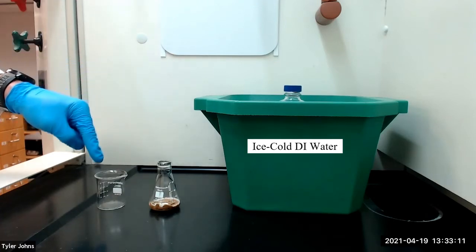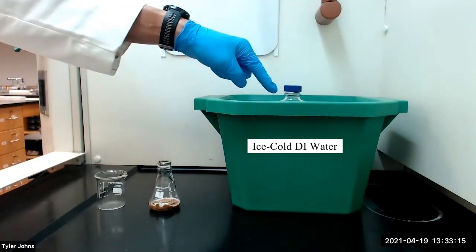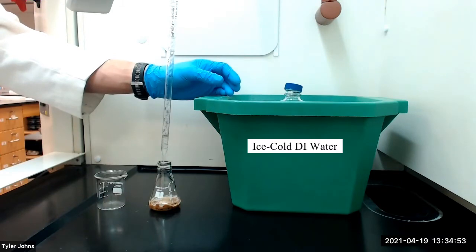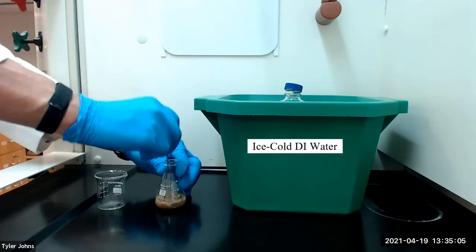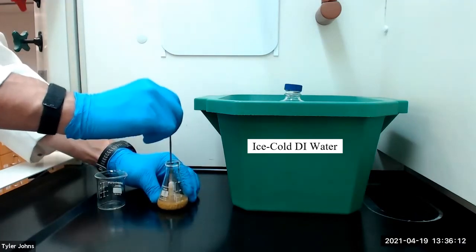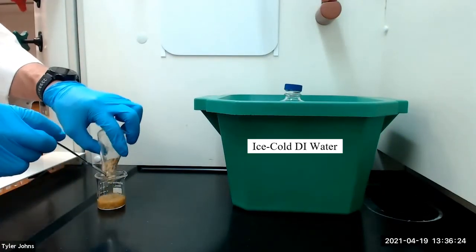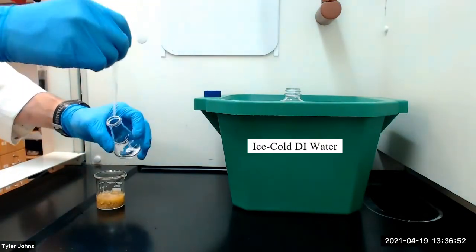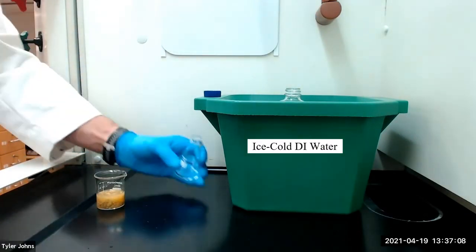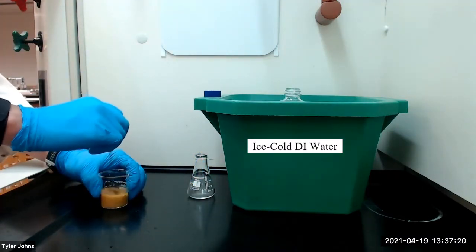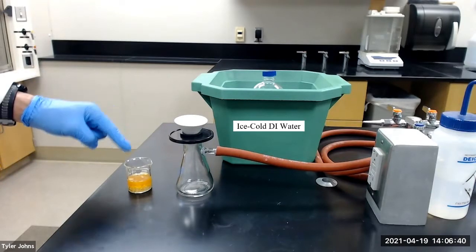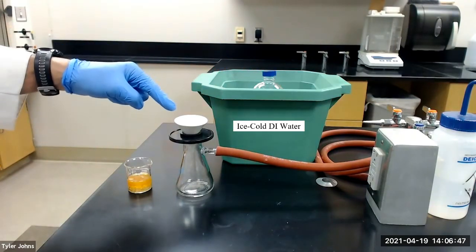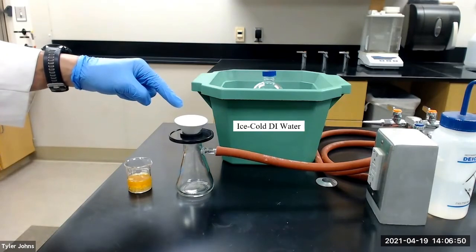We will then transfer the mixture to a small beaker using an additional 5 milliliters of ice-cold water. We will then stir the precipitate to break it up. We will next collect the crude product by vacuum filtration with a Hirsch funnel and use ice-cold deionized water to aid in the transfer and the washing of the product. We will then air dry the crude product for 30 minutes.